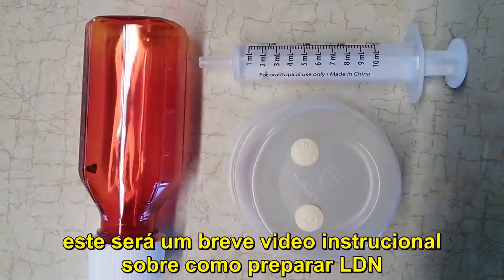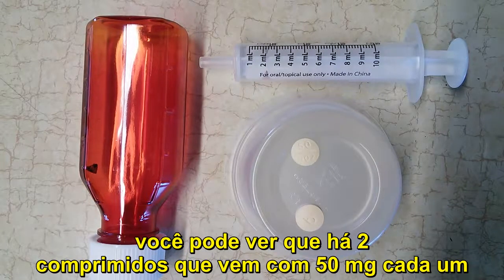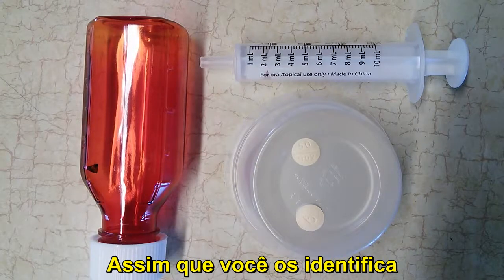This is a short instructional video on how to compound naltrexone for low dose usage. The tablets come — you can see the two tablets. One shows the back, the other shows the front. These are 50 milligram tablets, and that's where you identify them.